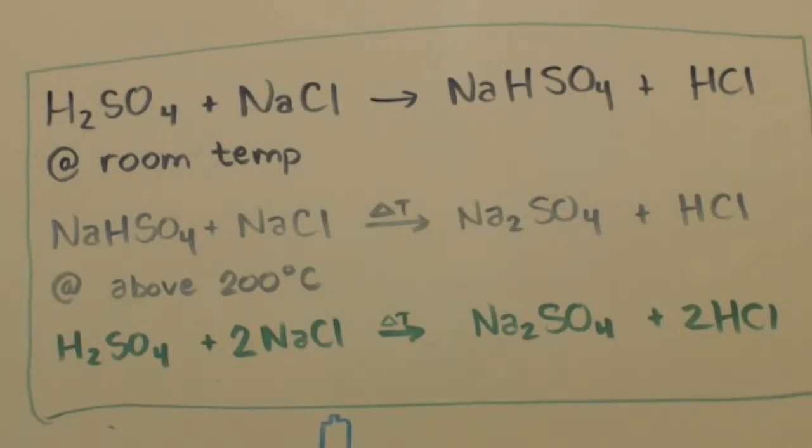We're here to make some hydrochloric acid, concentrated, hopefully. I did a video already on how to get it. You can buy concentrated HCl, I think like 32.5%, at Lowe's or the hardware store. But we're going to make it this time. It's not just how to get, it's how to make.